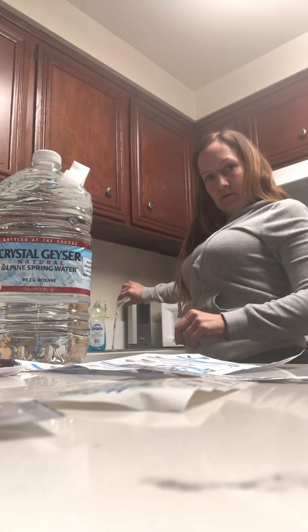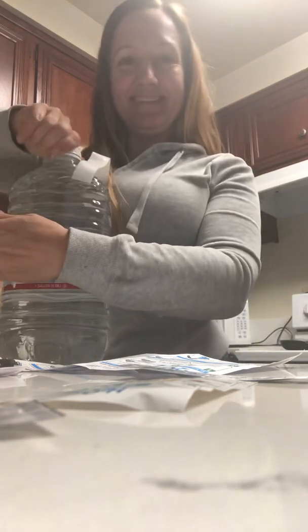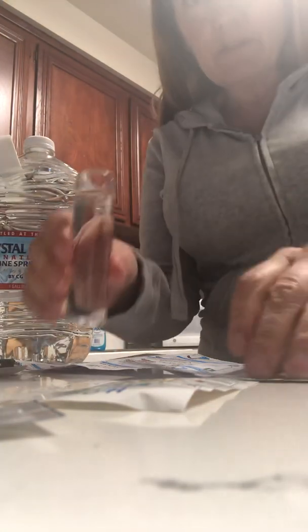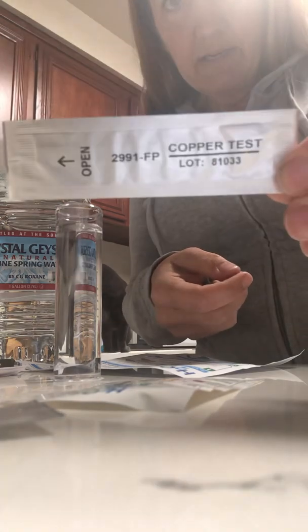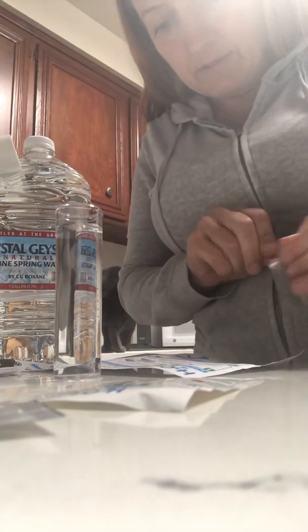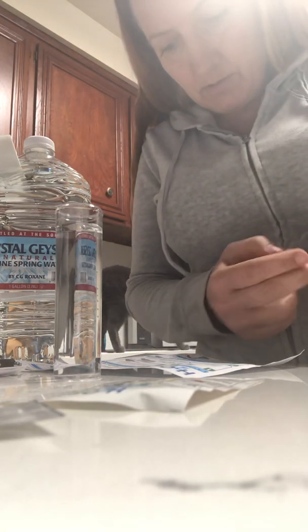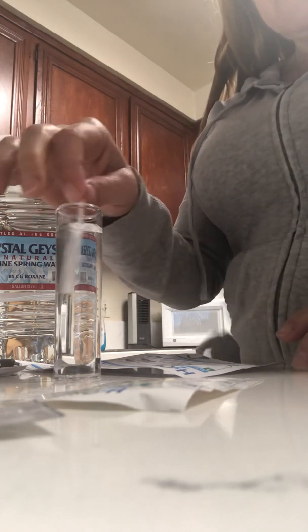I'm going to pour this out and put fresh testing water in. This is Crystal Geyser — it's going to be my new favorite. Here's our copper test. The copper test instructions say swirl 10 times, then wait 15 seconds. So here we go: 1, 2, 3, 4, 5, 6, 7, 8, 9, 10. And now wait 15 seconds.